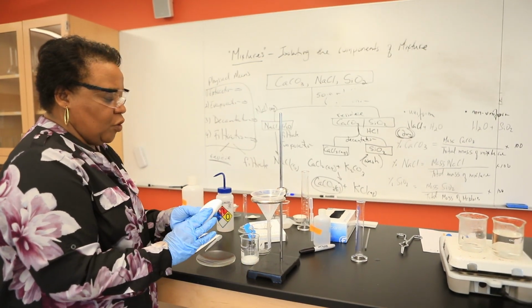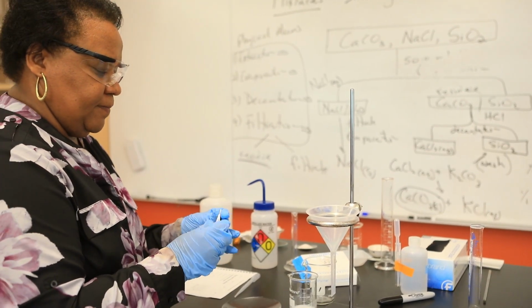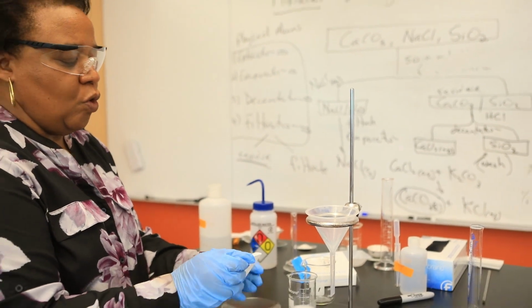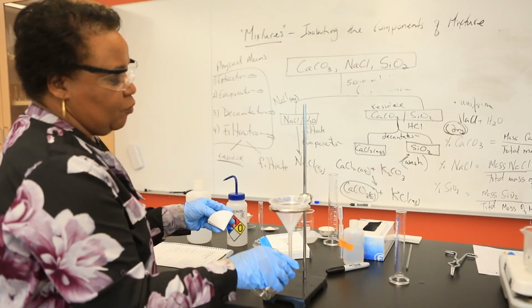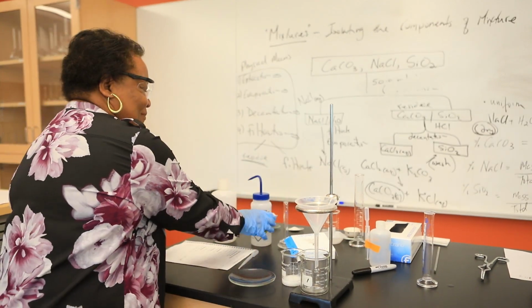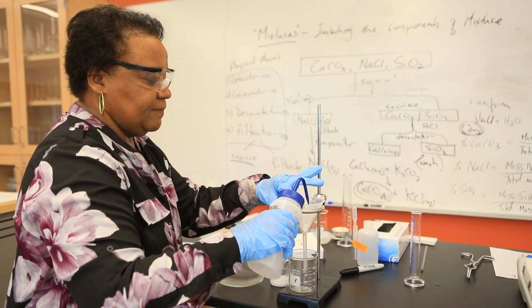Well, just as before, I'm going to flute our filter paper. First in half, then in a quarter. I will move 1/4 of that, and using my tap water, no, not tap water, I lied. Using distilled water, please. I'm going to try my best to hold that paper in place.